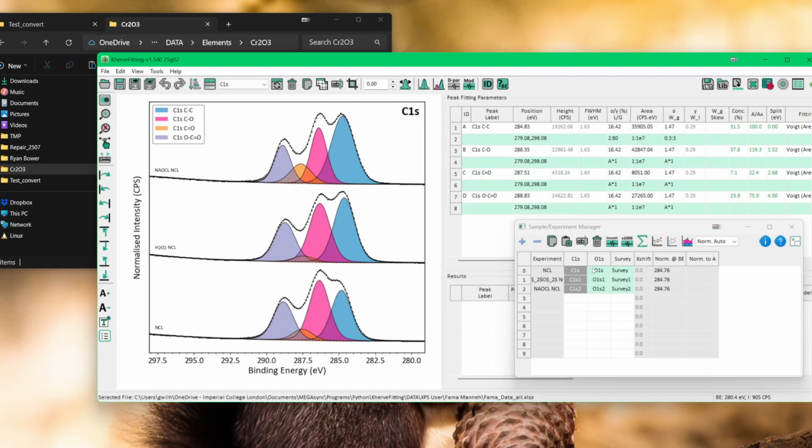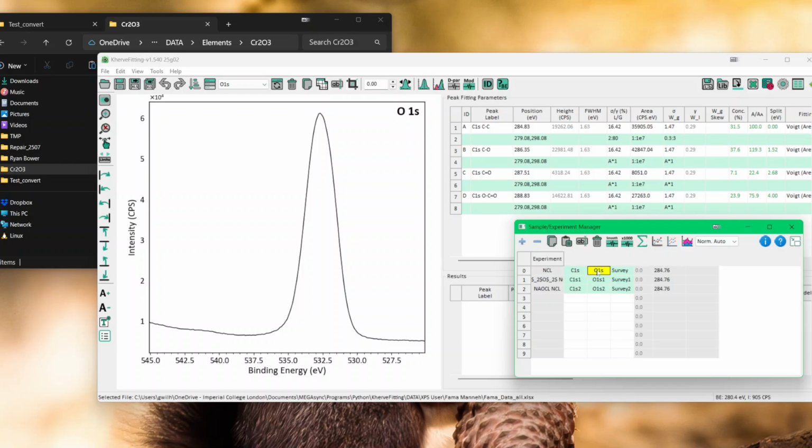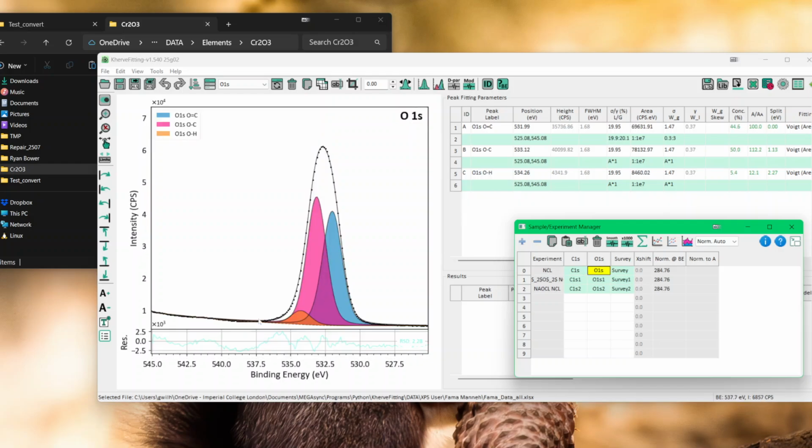The next feature is now you can't change the name. So if you double click, you can't change the name. And that's because it was creating mistakes every time you wanted to plot and it didn't work. So now single click, it does a quick plot. Double click, it does the proper plot. Okay, so that's now available.